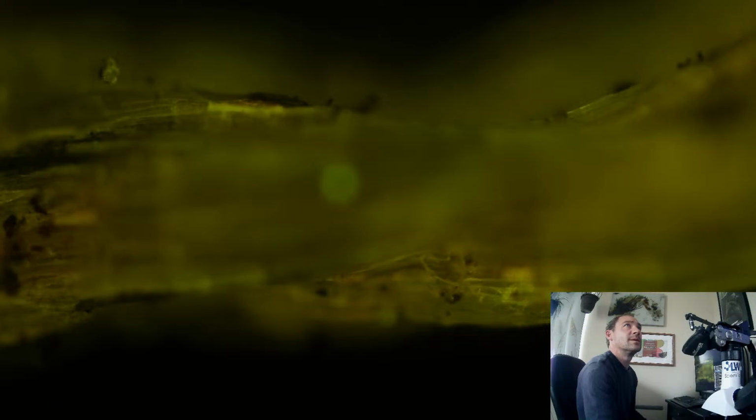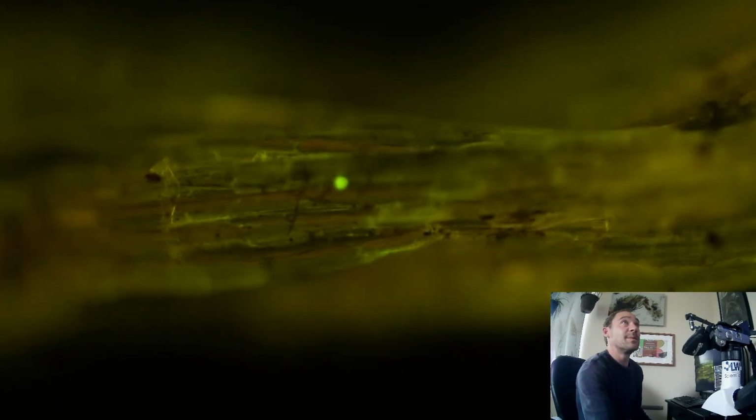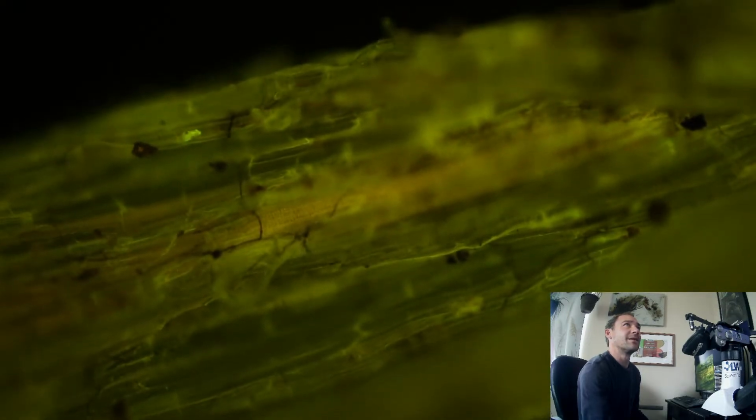Refocusing on this, and then we got one more slide for you guys today with 3 more roots. We got a raspberry. What else did I put on there? Oh, we got a tomato, which we're gonna save for last. The tomato, I actually inoculated the seed with mycorrhizae, so I'm interested to see what that is gonna look like.